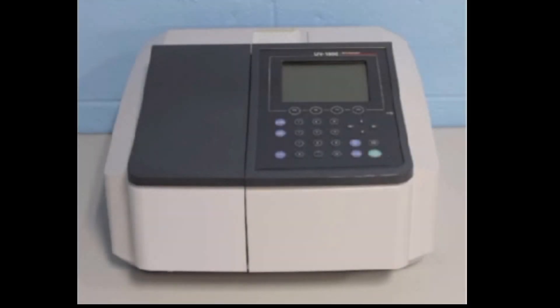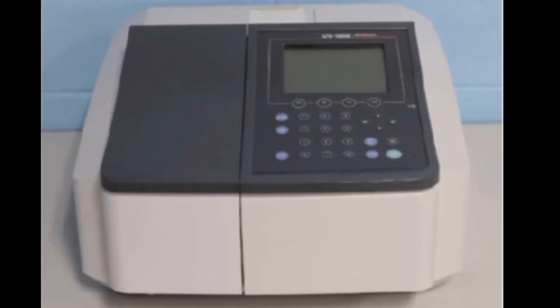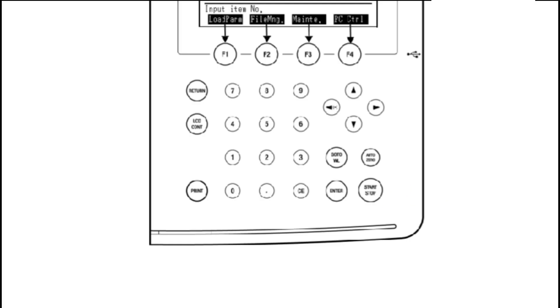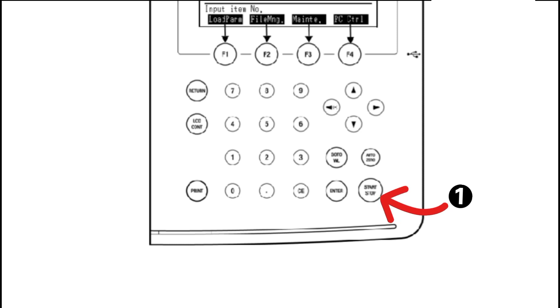Okay students, today in this video we will discuss basic functioning or the description of each key on the UV1800 keypad. Now let's start. Number one is the start and stop key for starting and stopping measurement. Once you've adjusted the parameters, like if we are going to take a spectrum, then we will press the start key or if we are going to stop the running spectrum, then we will press the stop key.